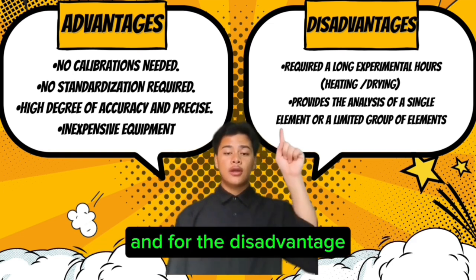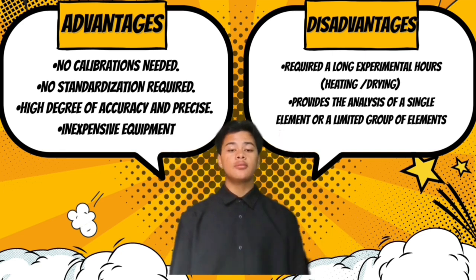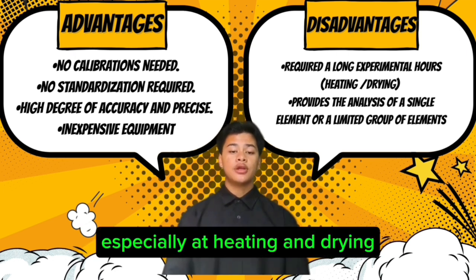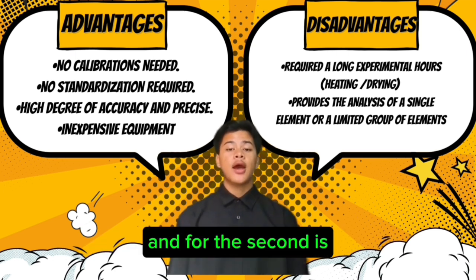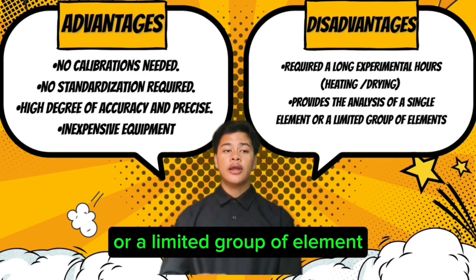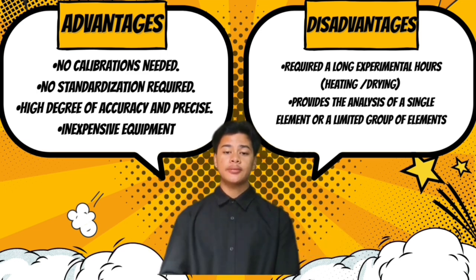And for the disadvantages: first, it requires a long experimental time, especially for heating and drying. And second, it provides analysis of a single element or a limited group of elements only.